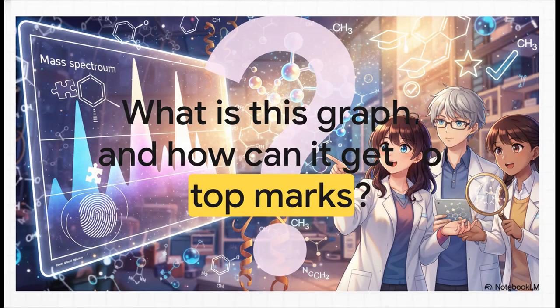So, what even is this thing? I know, at first glance, it just looks like a bunch of random spikes on a chart. But this is a mass spectrum. You can think of it like a molecular fingerprint. Every single line, every peak is a clue. And once you learn how to read them, well, it's a guaranteed way to score big in your exams.